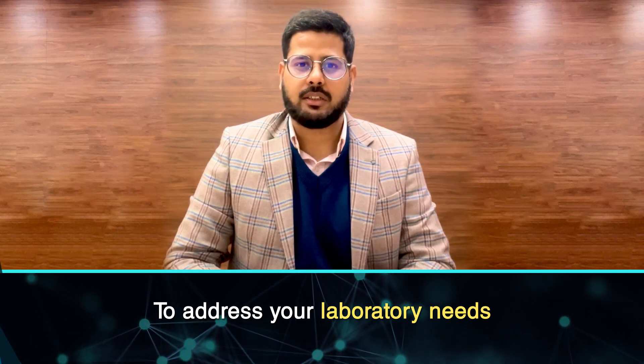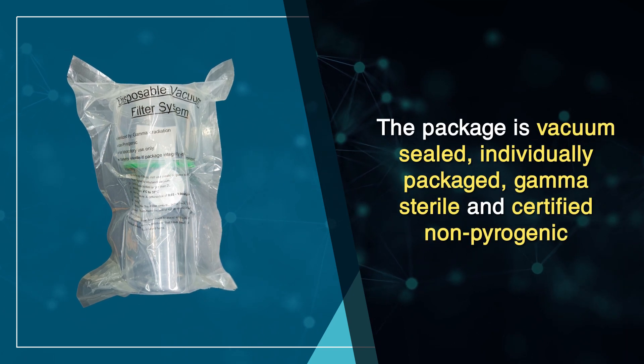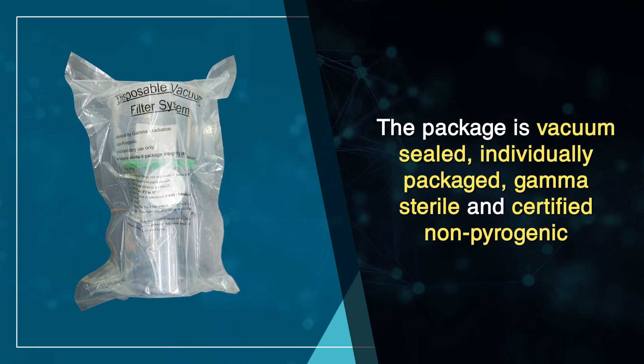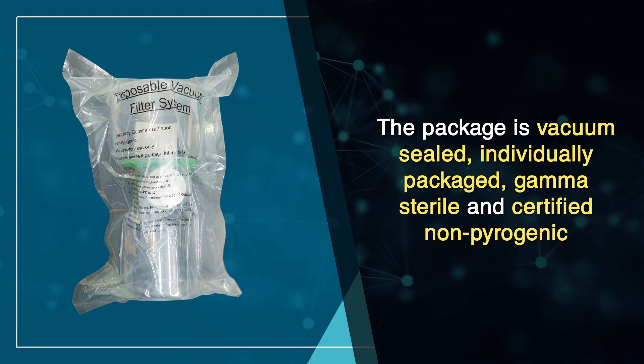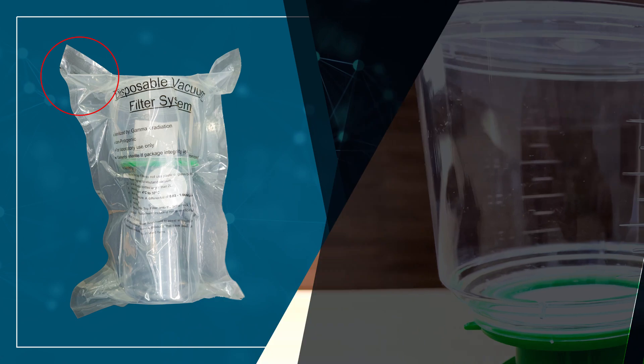Let us break down the features it offers. The package is vacuum-sealed, individually packed, gamma-sterile, and certified non-pyrogenic. The notch ensures easy tearing of the pouch.